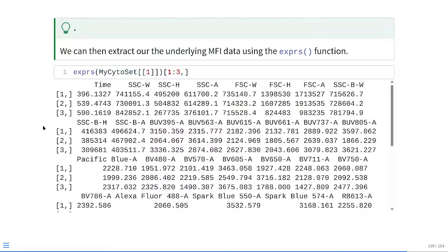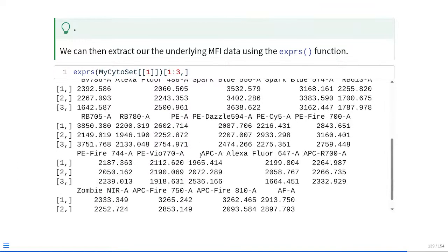Now, if we're looking at these values after a little bit, especially if you have a lot of practice looking at flow cytometry data, you can see these all are kind of pretty uniform. They're all roughly around 2,000, 3,000 or so in value, which is not very much when it comes to a biexponential scale. So right off the bat, you can start seeing this is the transformed data. It's not actually showing you the untransformed data that can be logs of the difference between individual cells.